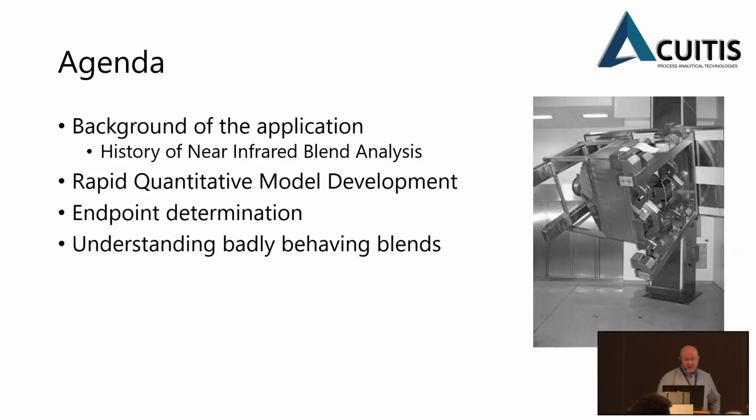So for today's agenda, I want to talk about some of the background of the application of near-infrared blend analysis and its development, how we can develop rapid quantitative methods, how we can approach endpoint determination, and importantly, how we can use the tool to understand badly behaving blends and formulations as well.